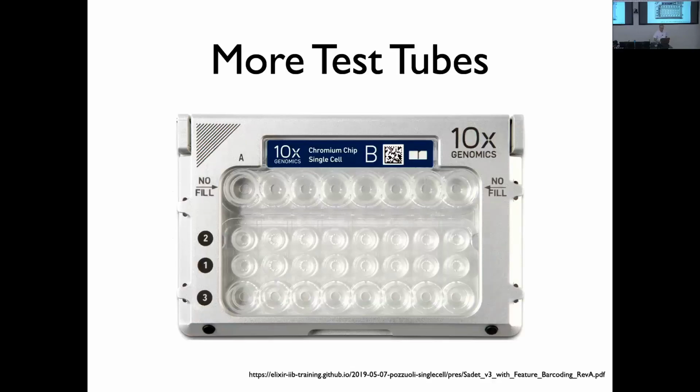But then the machine is going to run it through microfluidics that you can't see. And then at the end of running that, right here is where you're going to get your barcoded library out.